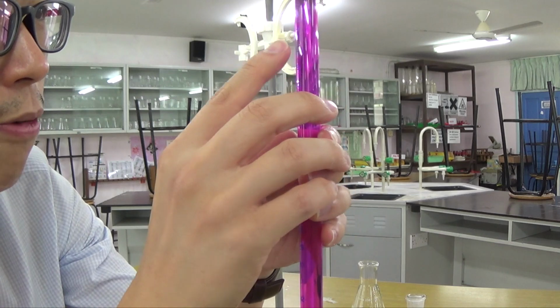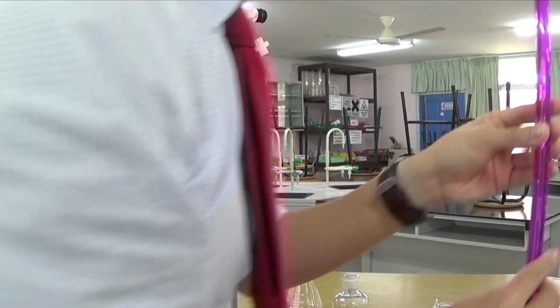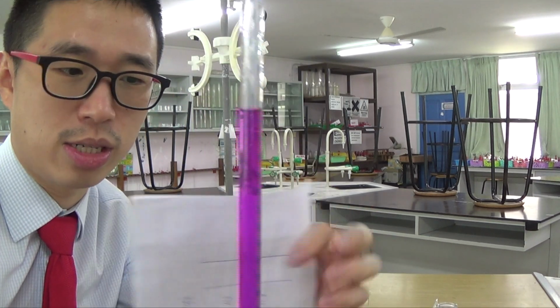I've got it to around 14 point something there. I should remove a little bit to go to 15. Again, I'm reading above the meniscus. Don't mind that you can read this because it's quite light, but you should imagine a scenario where you're given a much more concentrated solution where this is a lot darker.